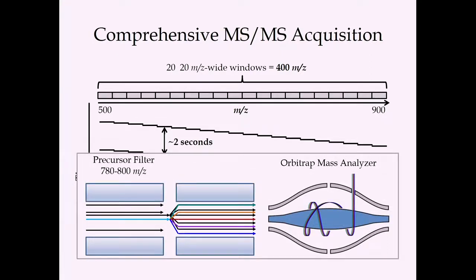Again, on an Orbitrap, in most cases, we're doing a quadrupole Orbitrap experiment, for a Q-Orbitrap type of hybrid instrument. This can either be a Q Exactive, a Fusion, or a Lumos. And if you look at a given isolation window, we're intentionally passing multiple precursor ions at once. We're subjecting those multiple ions to collisions, and then we're measuring that mixed spectrum simultaneously.